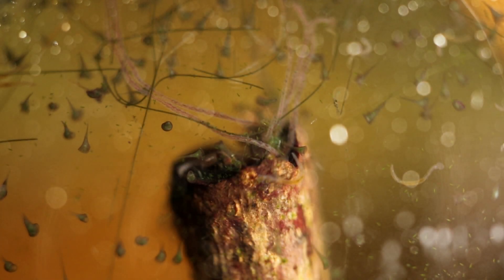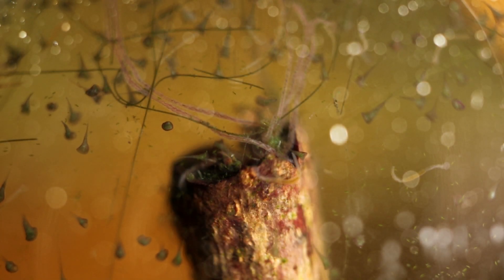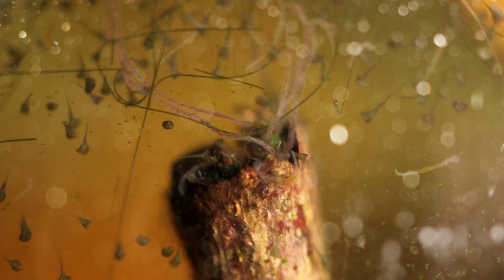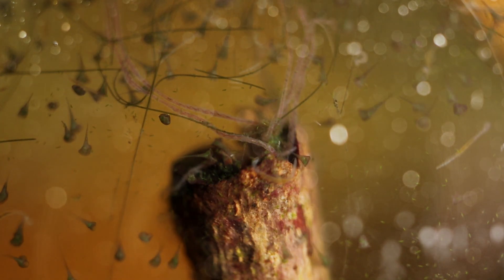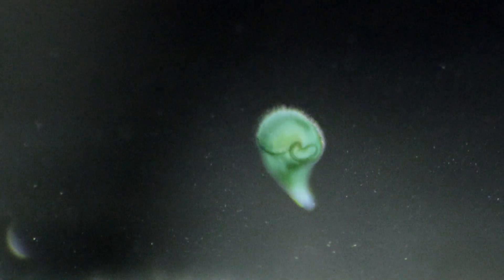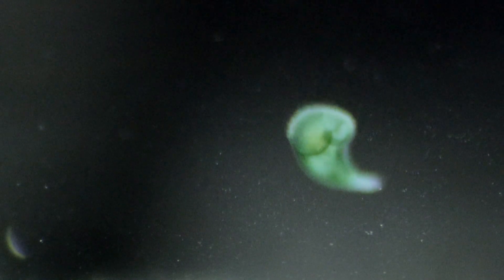I had to take some samples, and it's pretty hard to study them because at the end of the day they are very sensitive, tiny little single-celled creatures. If you want to put them underneath the microscope, you could damage them — especially if you put that top slide on. So I chose not to put the top slide on and allow them to move freely, just in a little drop of water.